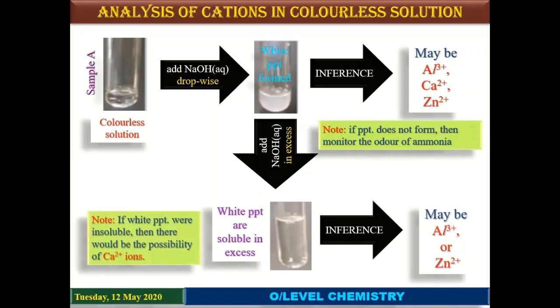If the white precipitate were insoluble, then there would be the possibility of calcium ion, but it is not the case here.